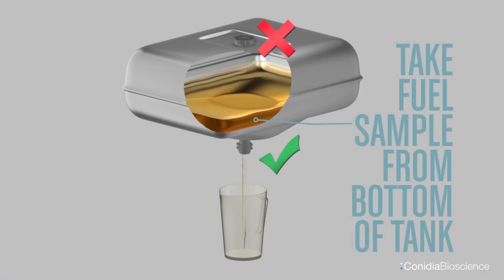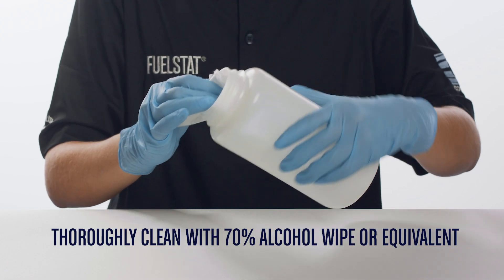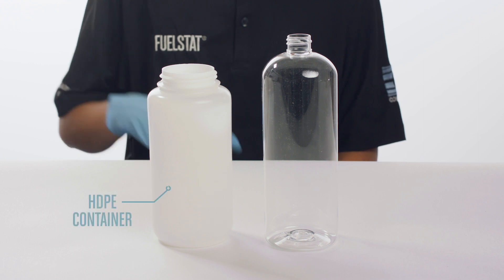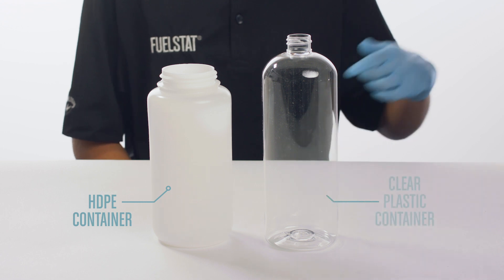Always take a fuel sample from the bottom of the tank. It is important that sample points and sampling equipment are clean, and to use a new sample container for each test to help minimise risk of cross-contamination. When cleaning a sample point or reusing a container, thoroughly clean with a 70% alcohol wipe or equivalent and leave to dry. HDPE containers are often favoured for use with fuel samples.